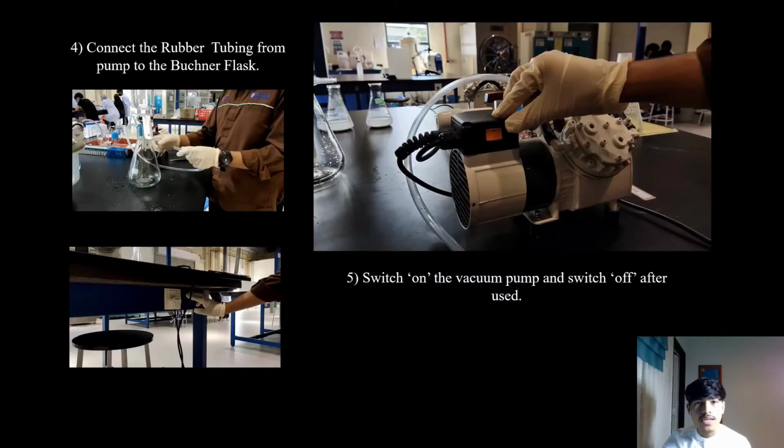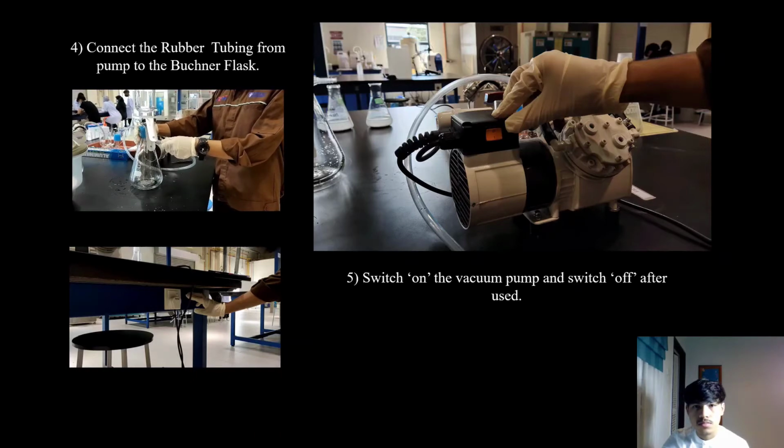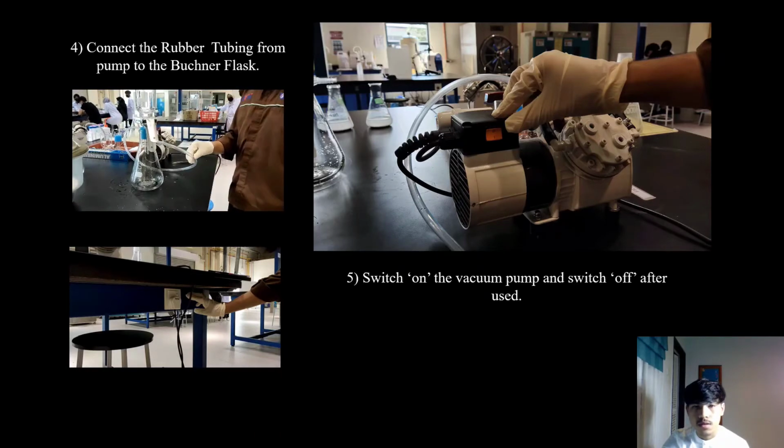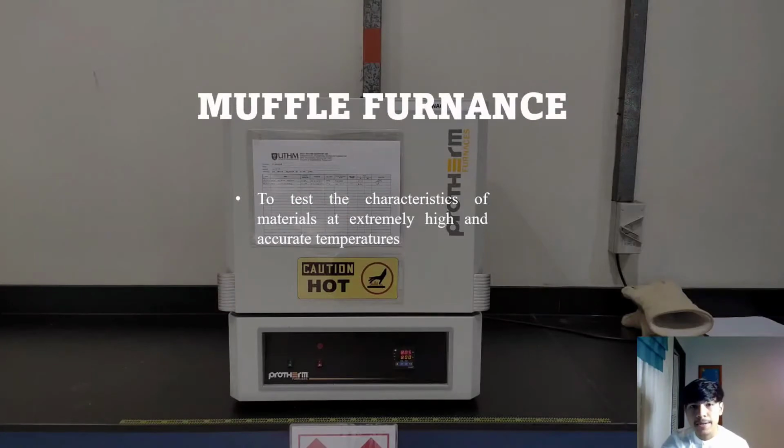Step 4. Connect the rubber tubing from the pump to the Buchner flask. Lastly, switch on the vacuum pump and switch it off after using. Lastly, I will explain about the muffle furnace.